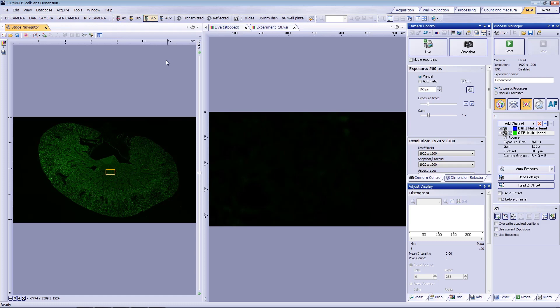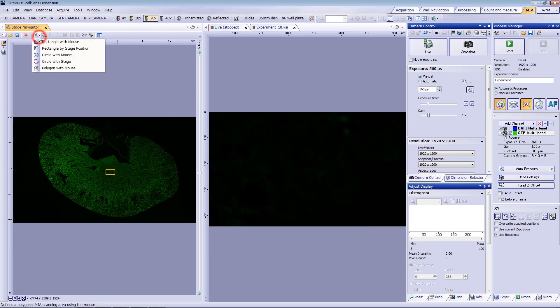To start, click the Create Polygon scanning area with mouse icon, and draw a line around the kidney section on the Overview image.